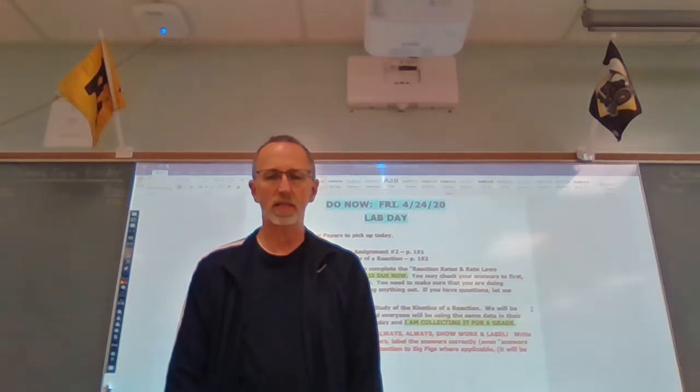Today we're going to do Lab 12.1, study of the kinetics of reaction. In our last couple lessons, we've been talking about kinetics and reaction rates. And in our last lesson, we talked about rate laws. In this particular lab, we are going to determine the reaction orders and the rate law of a particular reaction.